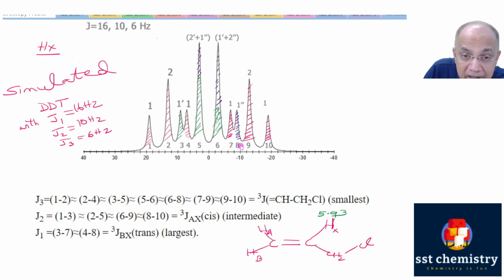And these two triplets, the midpoint is here. So between this and this. The best is to go 1 place to the left, just the immediate left. That is peak number 3, peak number 7. So this gap is the biggest J, and so 4 to 8. So I have taken only 2 values, 3 to 7 and 4 to 8.